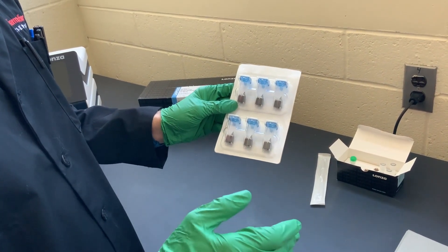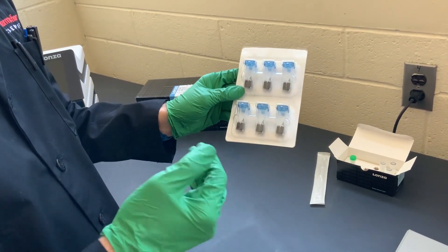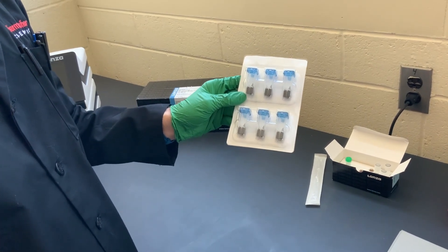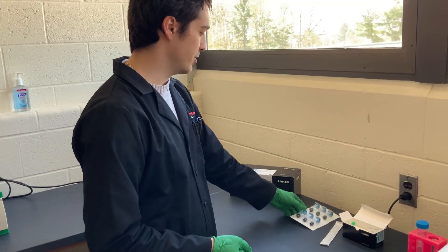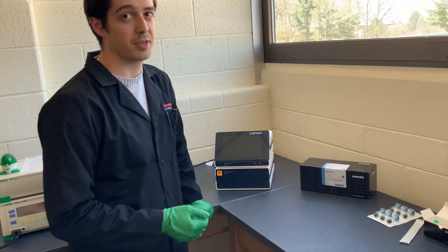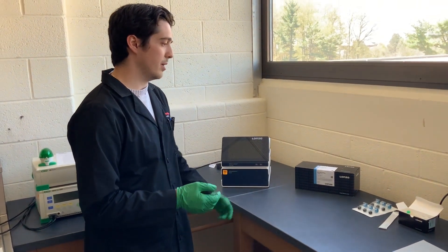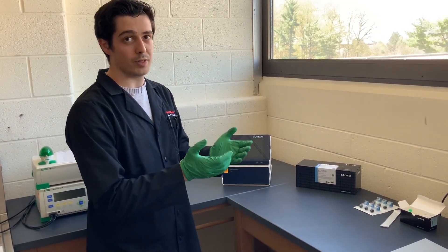They also have a higher-throughput method, which we have the capability of running here, that can run 16 cell lines or electroporation protocols simultaneously. In each of these devices, they have electrodes at the bottom that interact with components inside the nucleofector itself. It's important to be sure that when you place your cells into the cuvette, they're in between those electrodes.